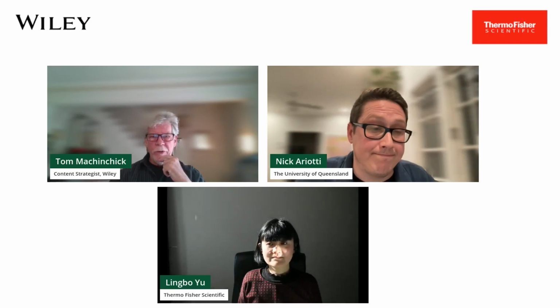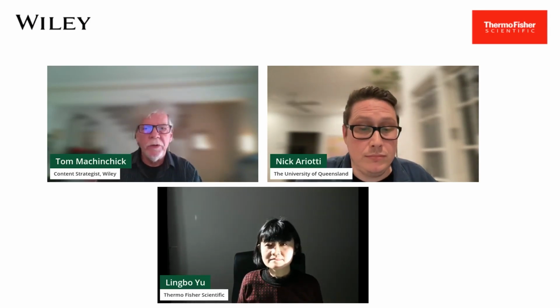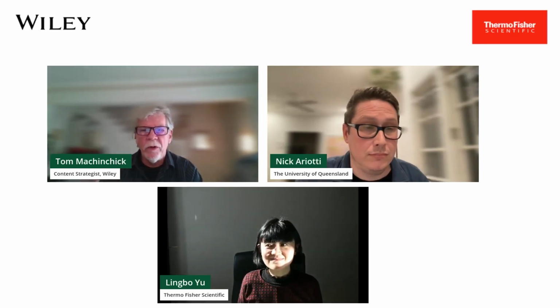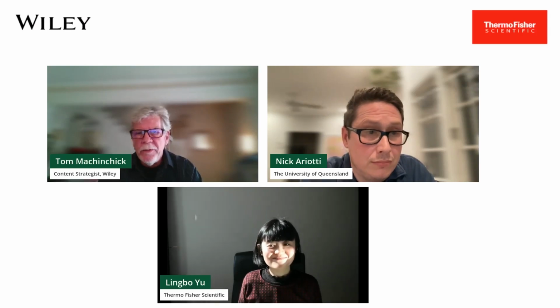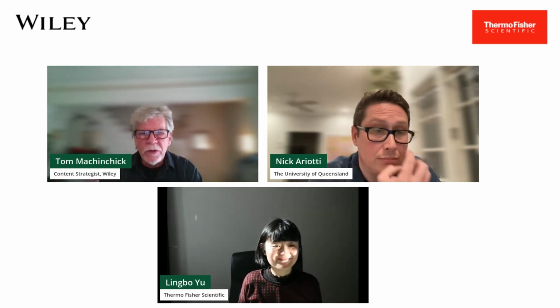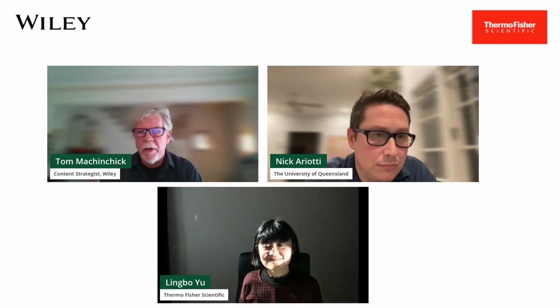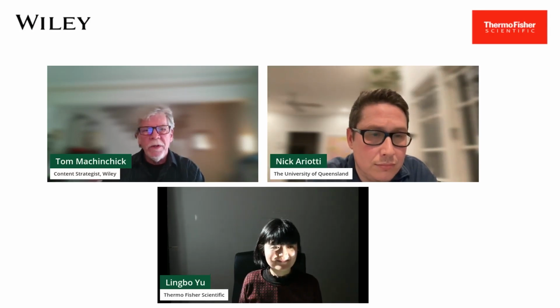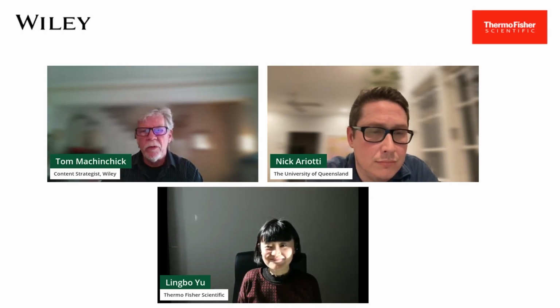Okay, and we only have a few minutes, 4 minutes left. This last question is for Dr. Yu. MAPS software is fantastic for correlative workflows, but is limited in its application to tomography. With the significant investment that Thermo Fisher is making in the correlation space, i.e. integrated fluorescence and cryo-FIB, what is next in the pipeline for Thermo Fisher tomography software? Is there any appetite for integrating correlative workflows into tomography?